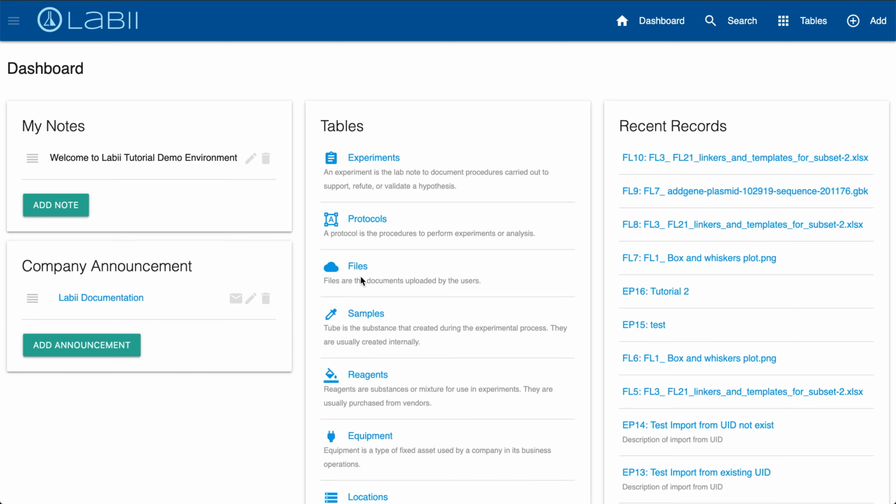And then the third permission level is view, and these will only be people that can view the records of a particular project, and you would only assign this permission to any members in your org who do not need edit permission controls. And just to note that admins do not have permissions to add or edit records if they are not added to a project. However, they have view permissions even if they are not a member of a project.